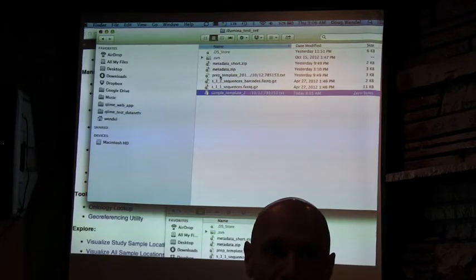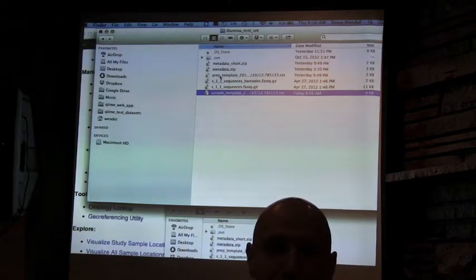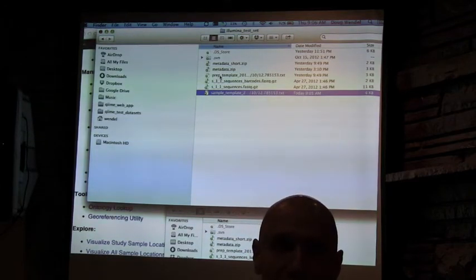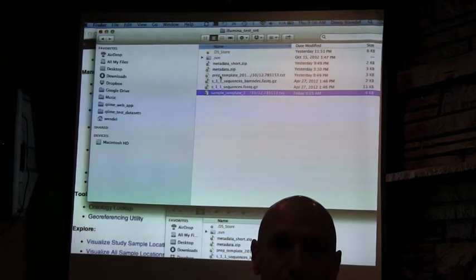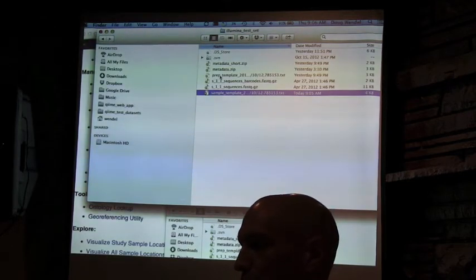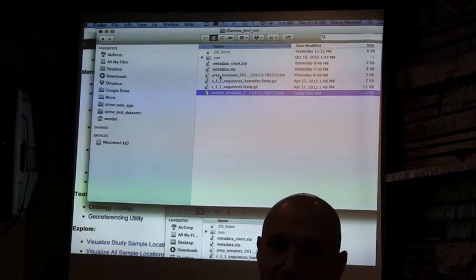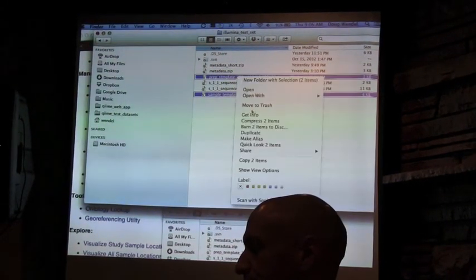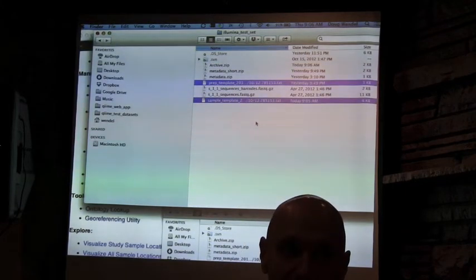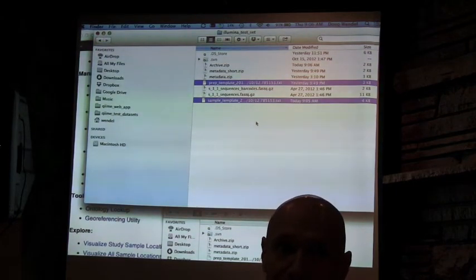If you're adding your own data, you could add 2 columns if you wanted to. For example, if you're introducing some brand new measurement that nobody has used before, you would probably want to introduce 2 columns. One would be the name of the measurement, and the other would be the units. Or what you can do is introduce a single column, and then you actually have an opportunity to add a description to this when it gets uploaded. And you can say it should be in meters, should be in grams, or whatever. That seems easier than having 3 different columns, right? Which is why we have done that for most of the columns, because converting from everything to everything else is incredibly time-consuming and costly.